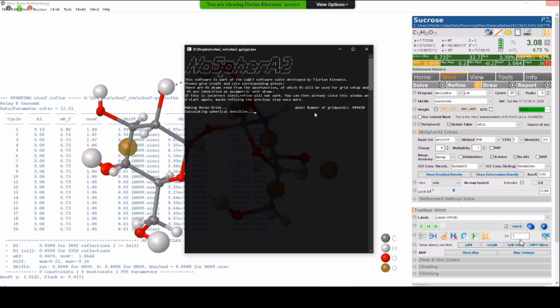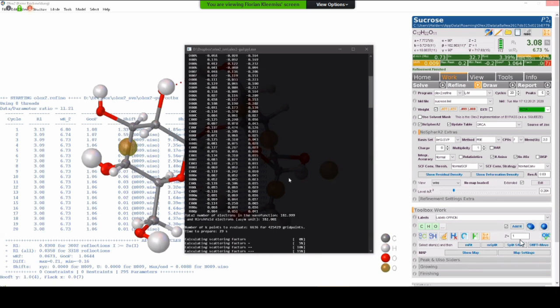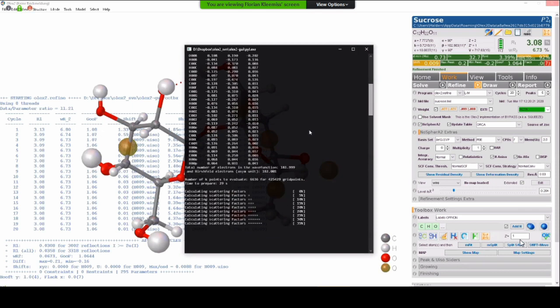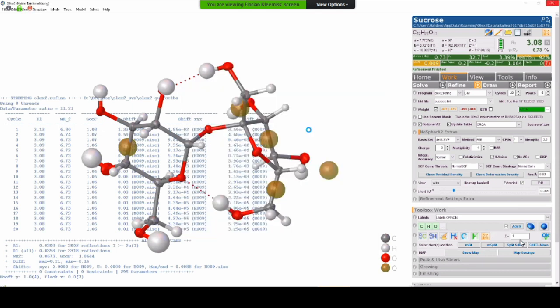And then we just partition the density. Now we have the partition density. So for example, the table I print here has Becke charges, spherical charges, and Hirshfeld charges. So these are the charges that we obtain after applying the partitioning scheme.